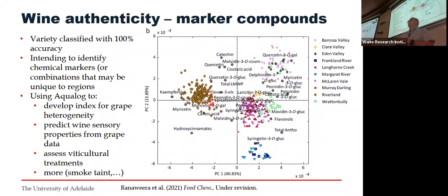And then we want to ideally understand what's driving these differences, so that the EEMs are picking up compositional things, chemistry, fluorophores, molecules. So can we now start to understand what they are and how these regions differ because of those? So that's what we're doing now. Ruchira is having a look at that. That's what's showing here. I won't go through that.